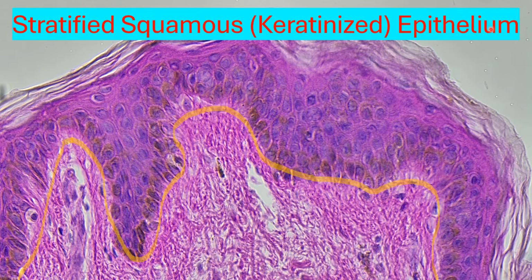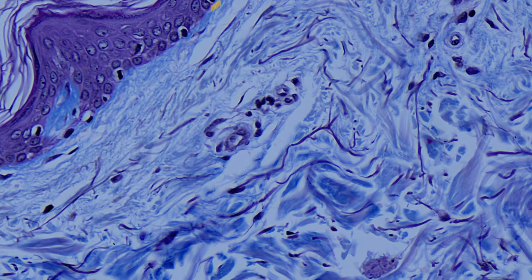So this is another example from the skin, and in this case we actually have some melanin pigmentation that's being secreted here at the basal layer from our melanocytes that gives us that darker skin color when we're exposed to sunlight. Identify this part down here.